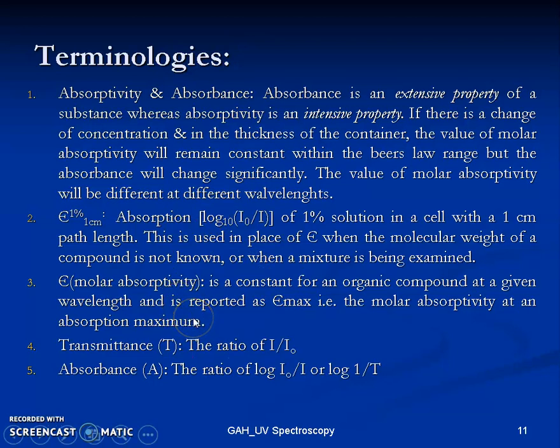The molar absorptivity remains fixed even if you change the concentration, still within the Beer's range, and the absorbance will change with the change in concentration. So absorbance and absorptivity are two different terms which should not be confused with one another. Transmittance is the ratio of I by I naught, and we already know that absorbance is log I naught by I, which can also be rewritten as log 1 by T. T is nothing but transmittance.